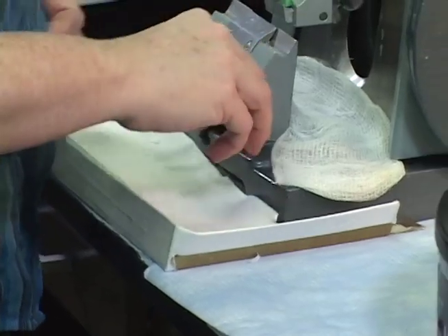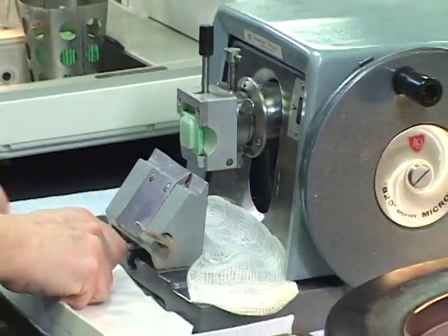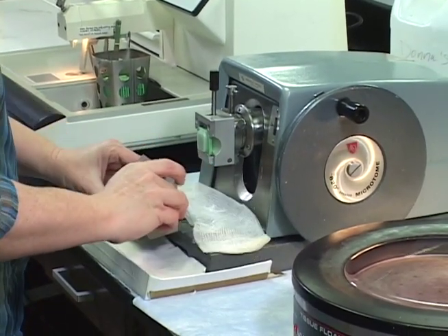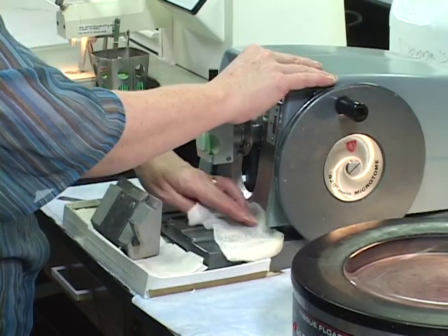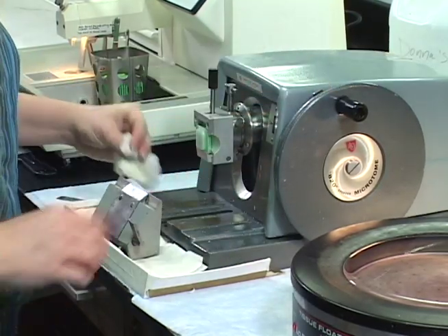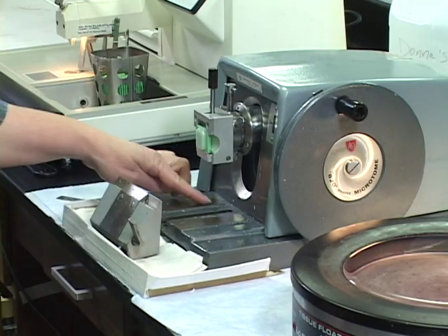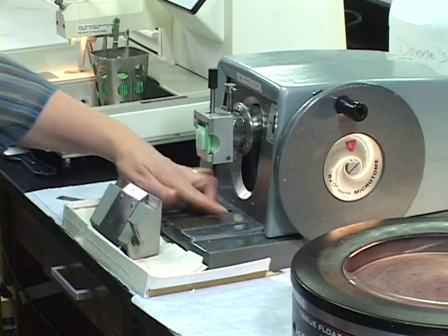So, this is in here, it's tightened. If you needed to remove this for any reason, you just move this lever over, and you can take this out. And you can clean the paraffin and clean this off. Give this a little oil if you've got that removed, just so it doesn't get rusty. You can see at some point somebody had got moisture there, didn't clean it up, and got it a little bit rusty for us.